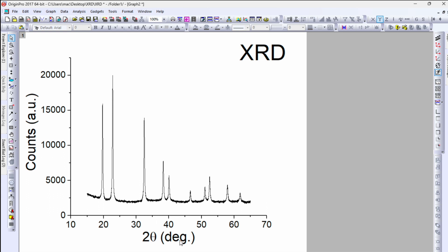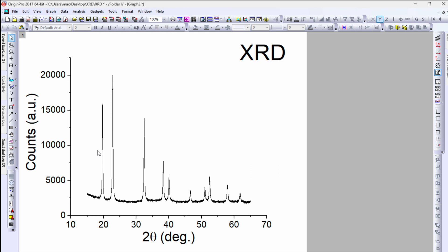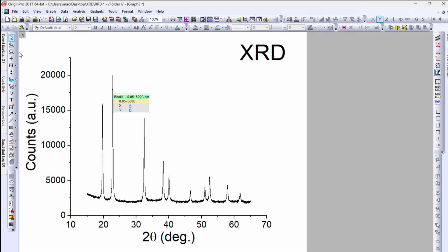This video covers XRD data where the x-axis is 2-theta and the y-axis is counts or intensity. In this video I will demonstrate how to perform peak fitting to XRD data. We will be considering only one single peak which has the highest intensity. To begin, first click on the scale-in button.